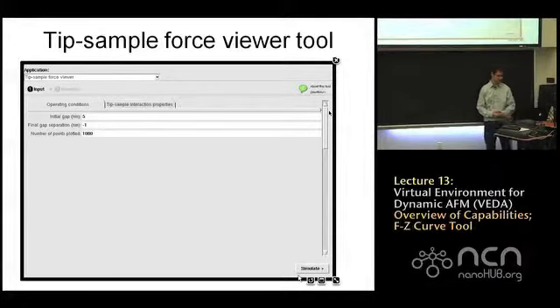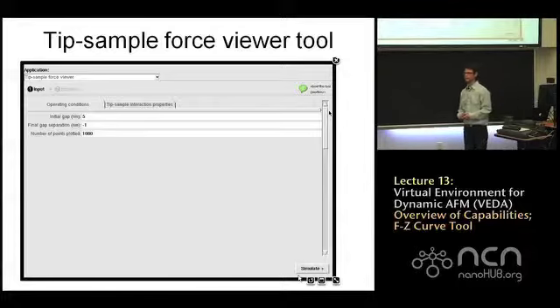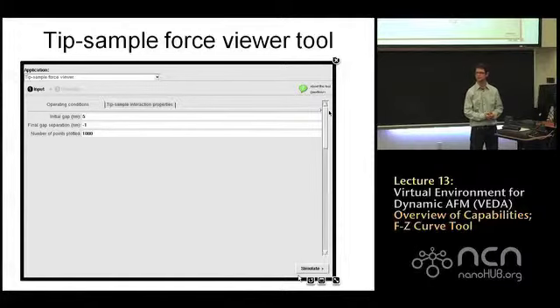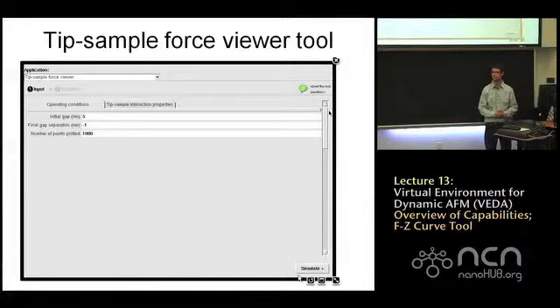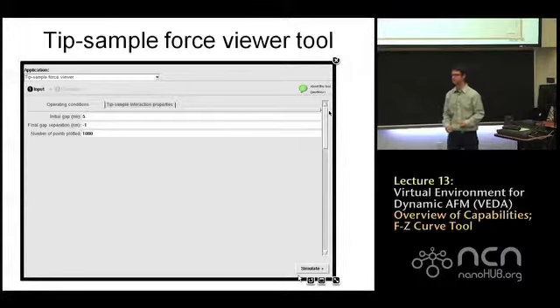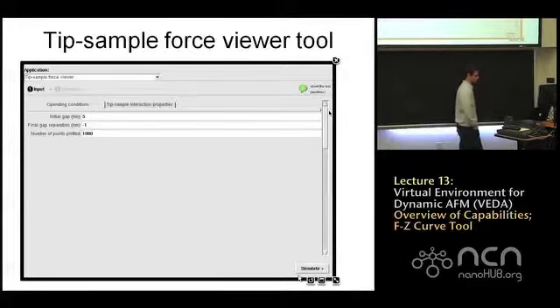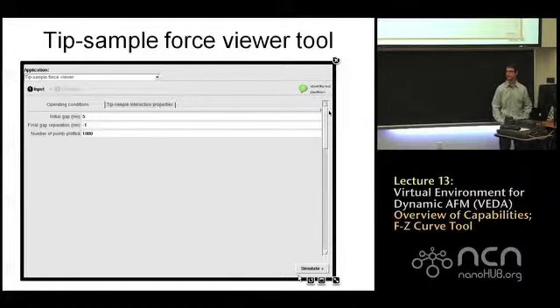And second, if we select the tip sample interaction properties tab, you'll find... John, they did not enter those numbers. Can you please go back? Right, make sure you're asking them to enter 5 and minus 1 in there. Do you want them to do that? Yes. Okay, so please give that instruction. So if you can change the defaults from, I think it's 10 and 0, to 5 and minus 1 for the initial gap and the final gap in the first two. So does everybody have that?